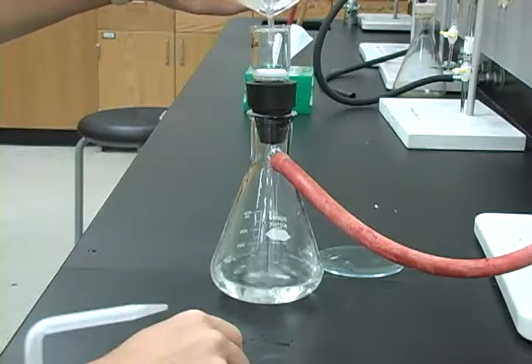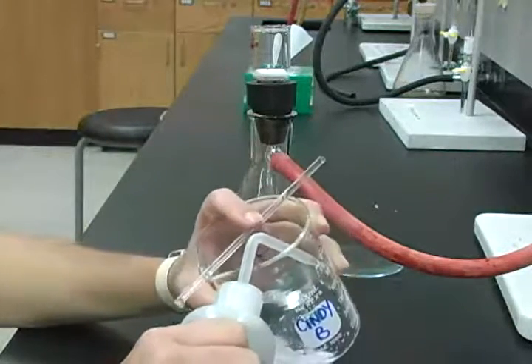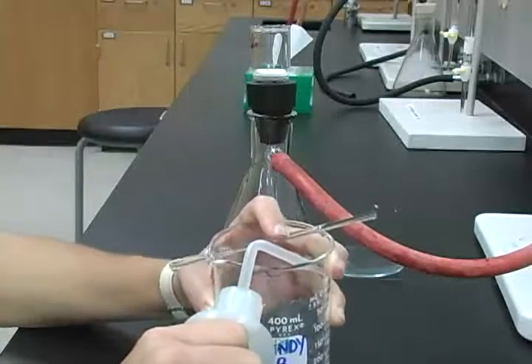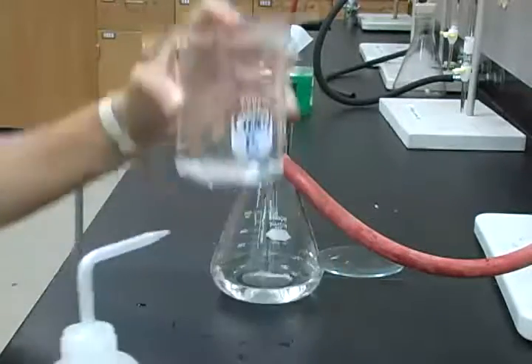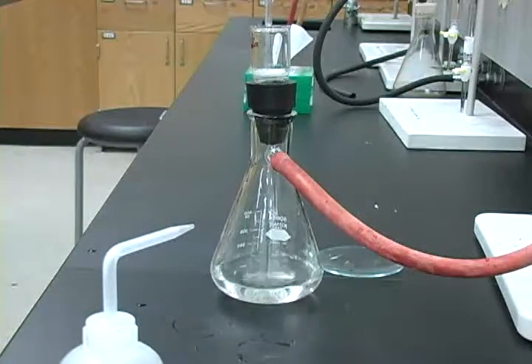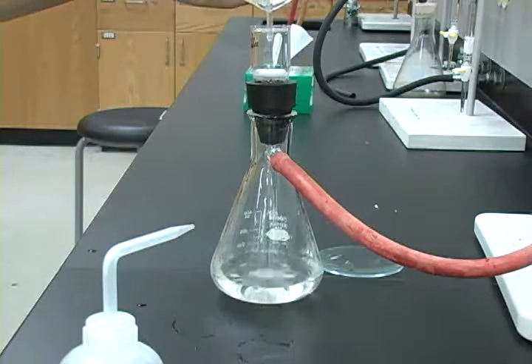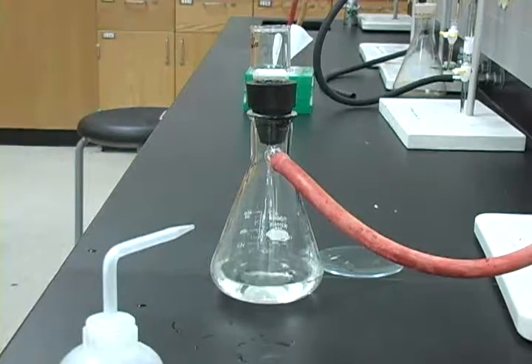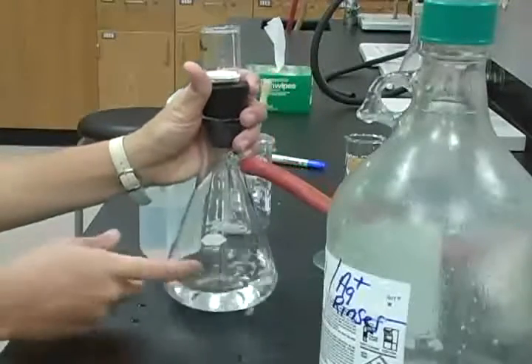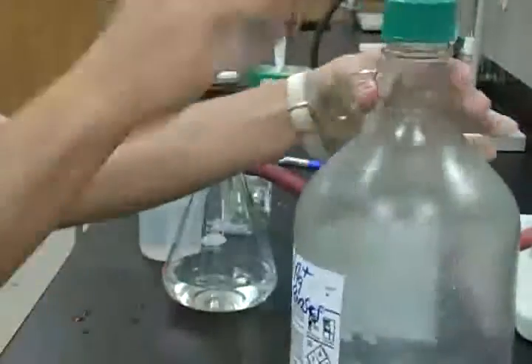After 3 to 4 times, you will then test the filtrate to see if silver ion is still being removed. Using the wash solution removes any impurities away from the silver chloride precipitate. We want to continue until all of the silver ion has been removed. After washing the precipitate 3 to 4 times, you want to discard the filtrate into the waste bottle that's marked AgCl and Ag rinses.